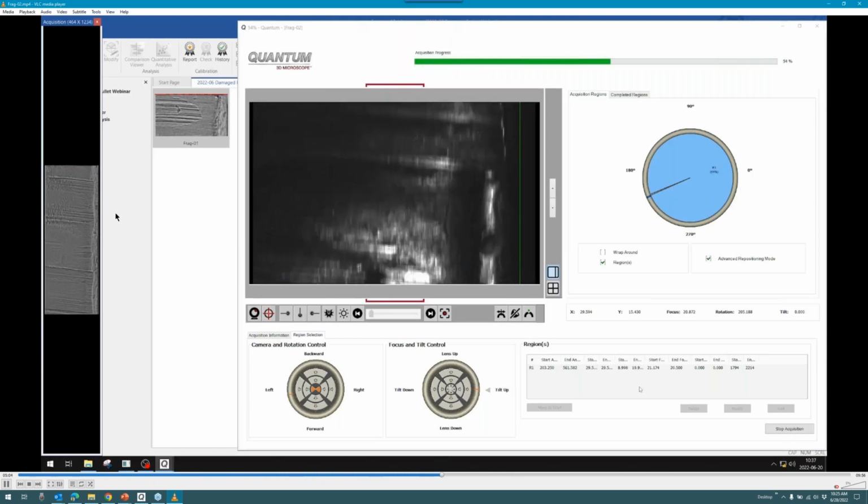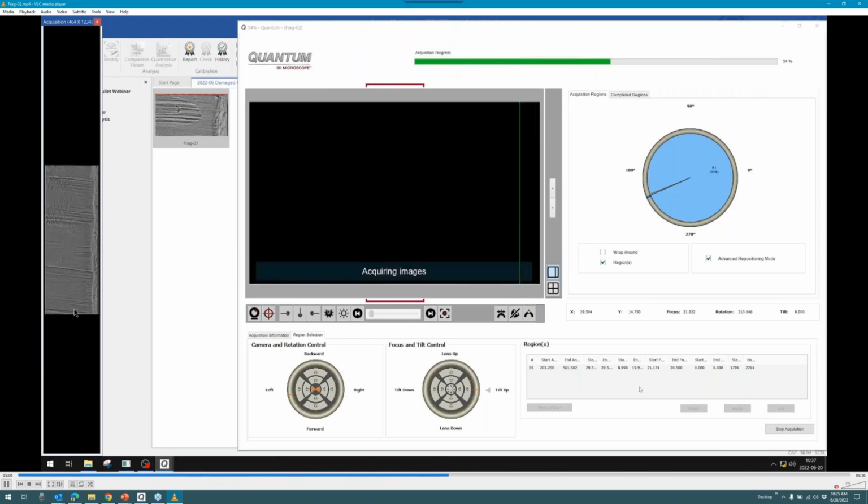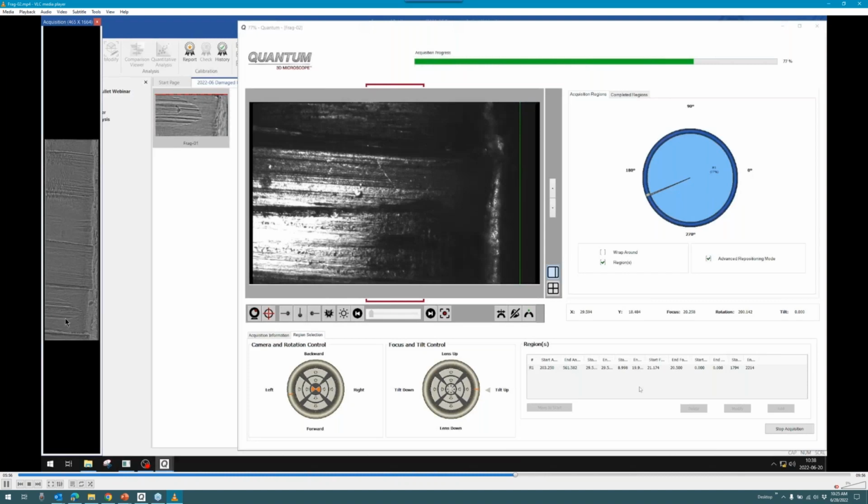We're about halfway through now. First one's done. Second one, we've got all the way down to the bottom shoulder here. There's a third land impression to cover. Let's jump ahead in the video again. Good marks in that groove impression, and we're starting the final land impression here.